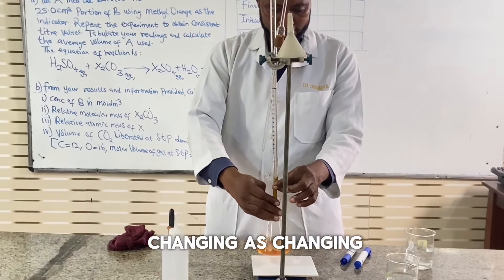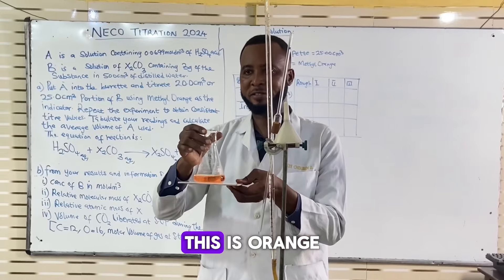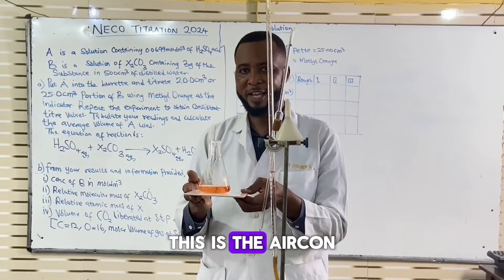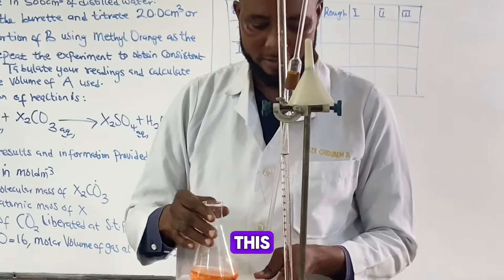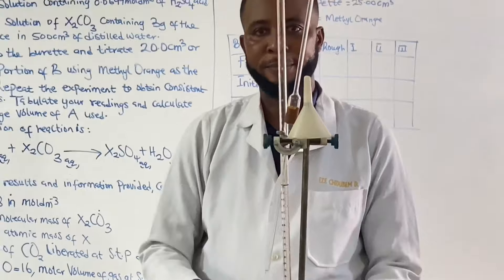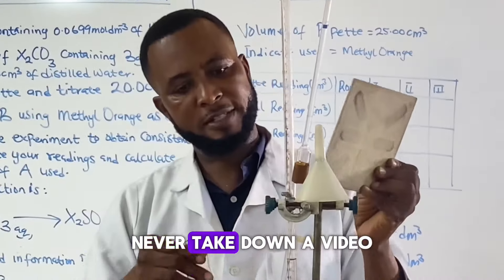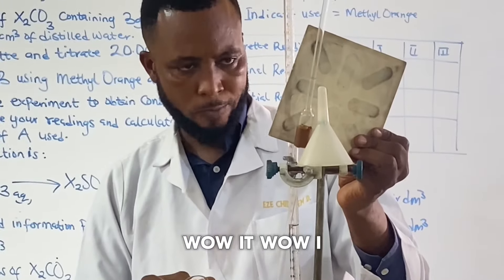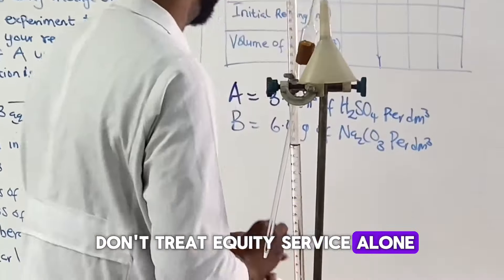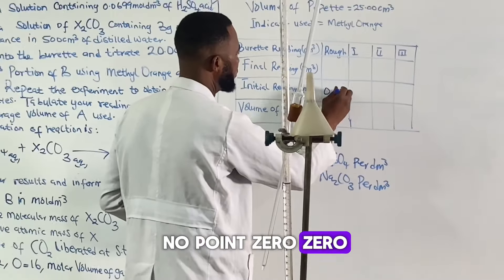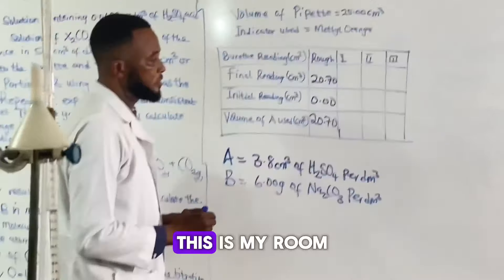It's changing! As it's changing, I keep adding drops. This is orange — it's at the endpoint. That's changed. The acid has neutralized the base. Let me take down the reading. I found the final reading is 20.70. I started from 0.00. So it's 20.70 cm³. This is my rough run.